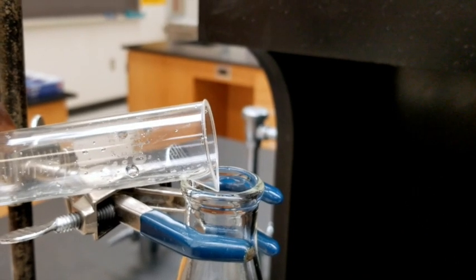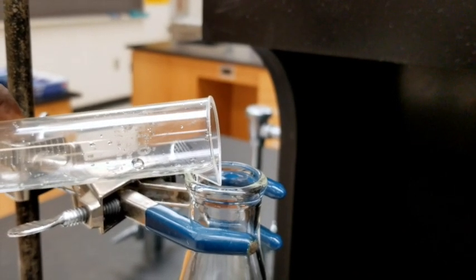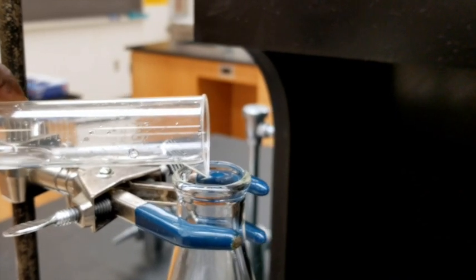Pour the 15 milliliters of hydrochloric acid into your empty 125 milliliter Erlenmeyer flask mounted on the ring stand.